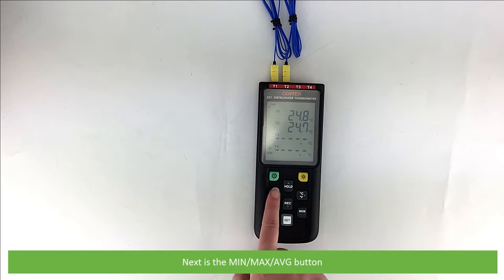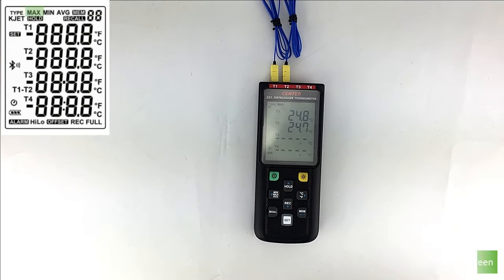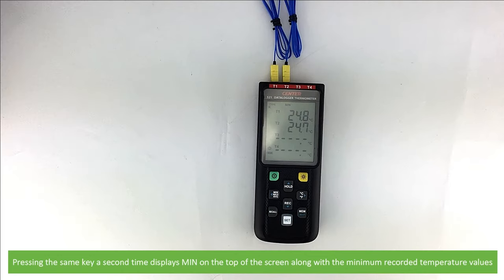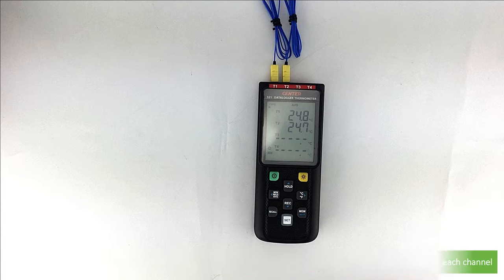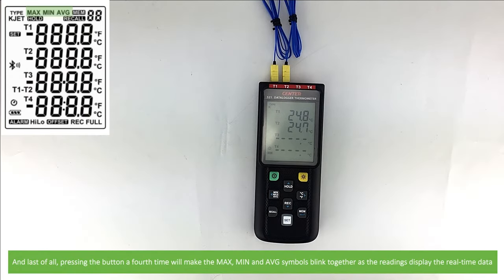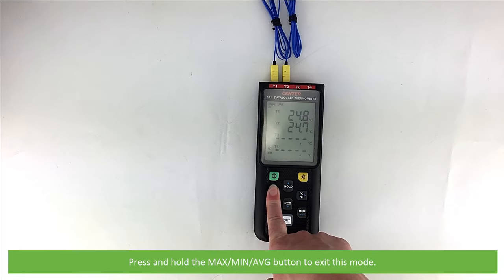Next is the min, max, average button. Pressing this button one time displays the maximum recorded value on the LCD — max will appear on the top of the screen. Pressing it a second time displays min along with the minimum recorded temperature values. A third press displays AVG along with the average temperature values for each channel. A fourth press makes the max, min and average symbols blink together as the readings display real-time data. Press and hold the max/min/average button to exit this mode.